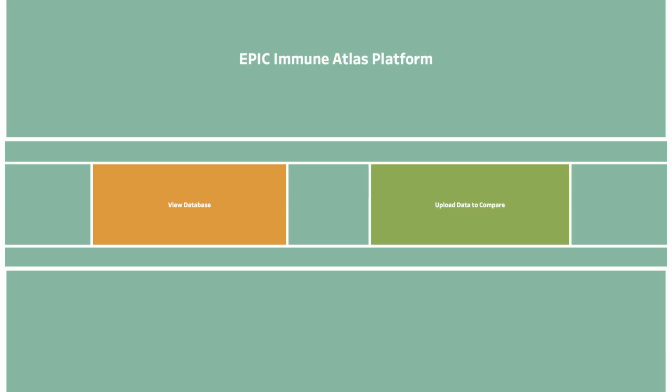Hello everyone, my name is Panlu, and today I'm going to demonstrate to you our EPIC Immune Atlas platform. EPIC stands for Extended Phenotypic Immunome Characterization.